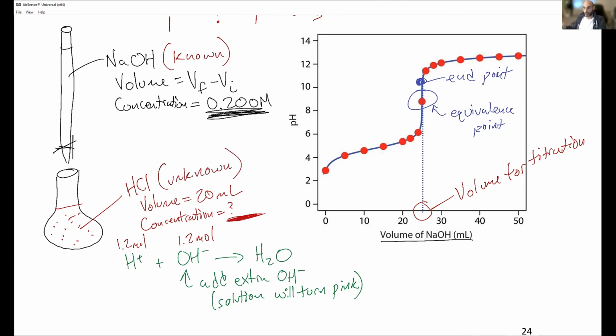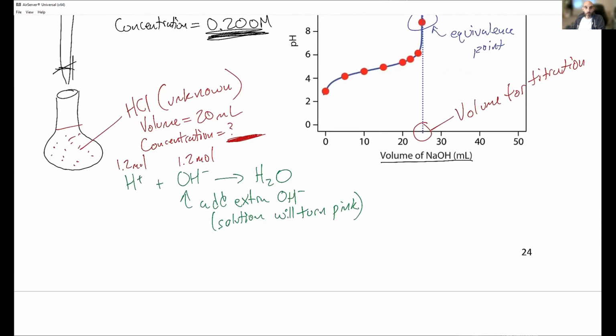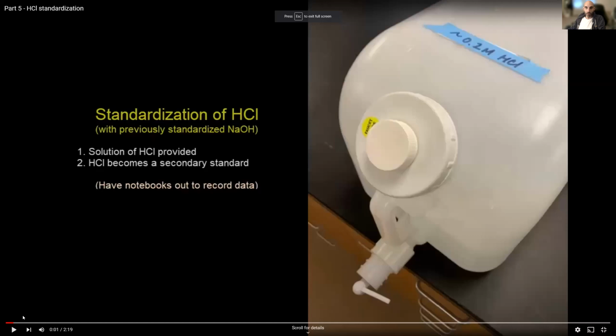this is unknown. Okay, so let's take a look at an example of this, and I'll take some notes and we'll write it down. We'll do this quick calculation to figure out what we actually have. So let me just switch it over, new share. Okay, so this is a video that I did for online labs last year because of COVID. So here we go. Here we have a standardization of an HCl.